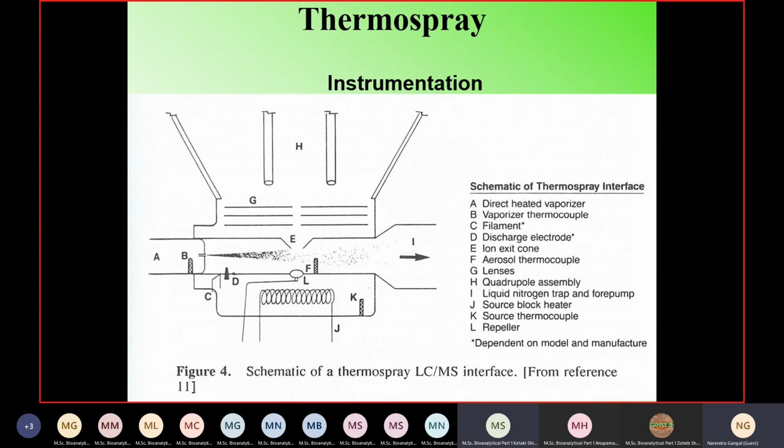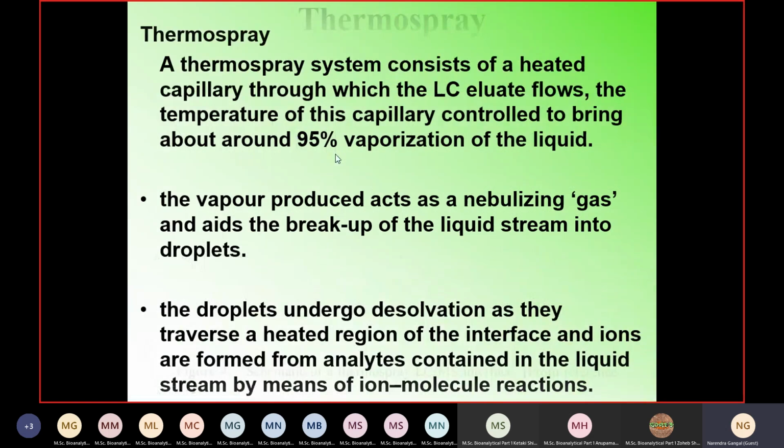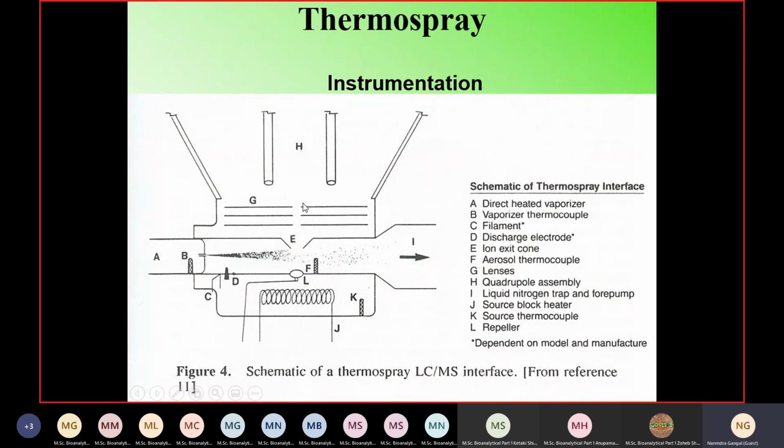They attract the molecular ions. They attract and repel both. Not only the molecular ion, it will be attracting all the fragments. See, when the ions are formed, this portion doesn't know whether it is a molecular ion or a fragment. The fragment also is a positively charged species, and the molecular ion also is a positively charged species. Whether molecular ion or fragment will be known by the mass analyzer subsequently.